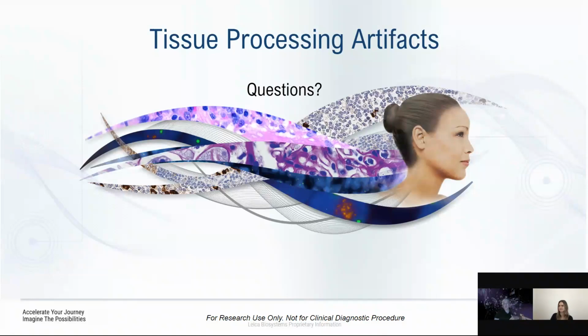For those of you that are studying vessels, any kind of clot or atherosclerosis that you're trying to preserve, then maybe do the minimum on those types of cases. But anything else where you don't need that blood and it's just a byproduct of the process of removing it, then I certainly would try to rinse it just to keep the bottles clean, right? I think that's the biggest impact I know of.